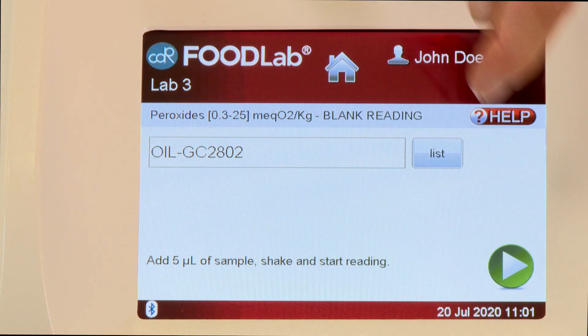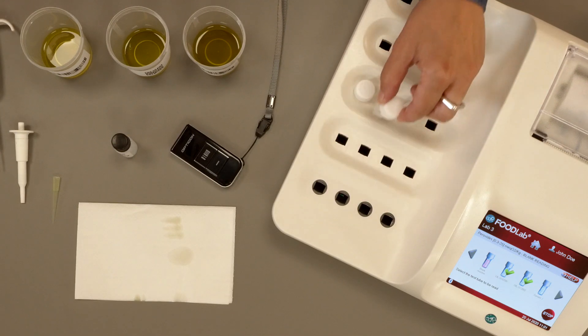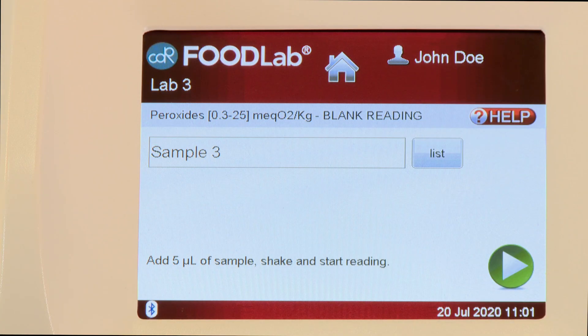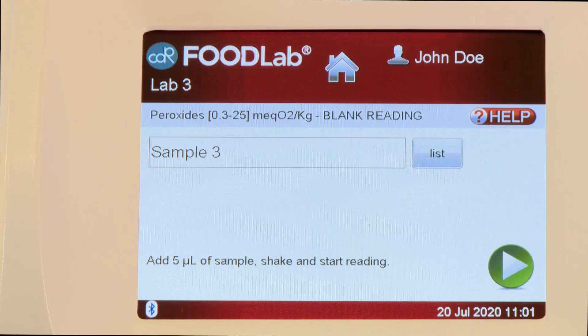Then press Next to start the blank reading. At the end of the reading, place the second test tube back in the incubation cell. Select on the screen the third test tube to be read. Read the barcode of the third sample by using the PX20 Reader. The sample code will appear on the screen.